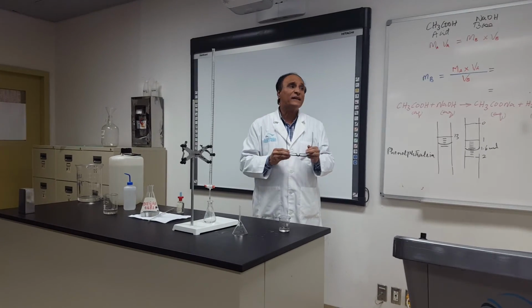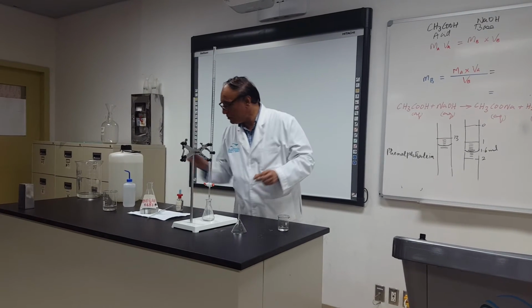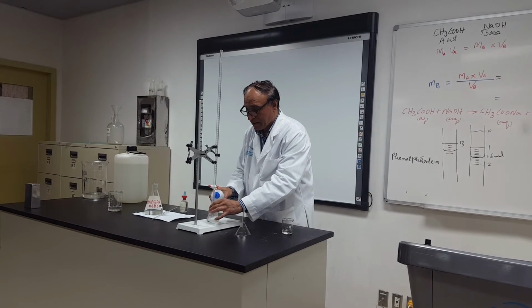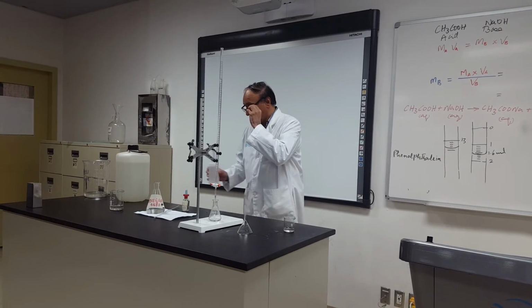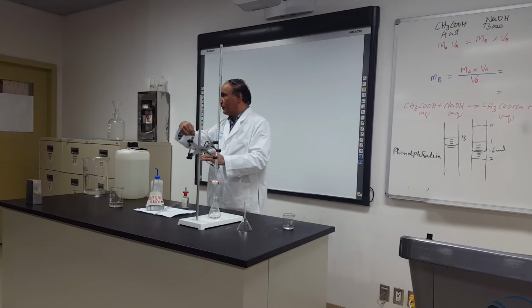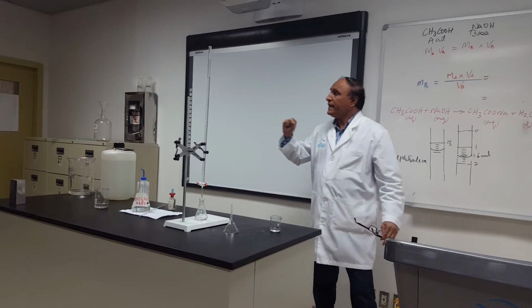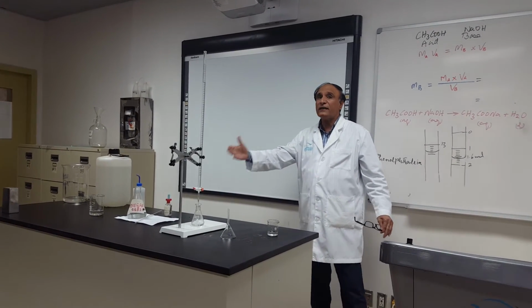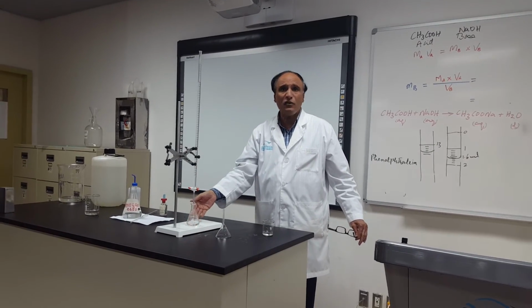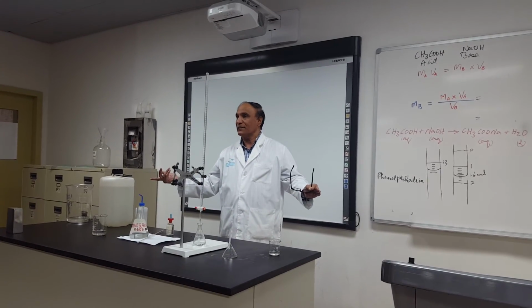Yes. If, for example, some drop touches the wall, you can put water. Look, to remove the drop, like that, you can put water. Now, when you put water, it makes no problem, because water is not reacting with this one. There is 10 milli, and if you even put half full of this water, it makes no difference.